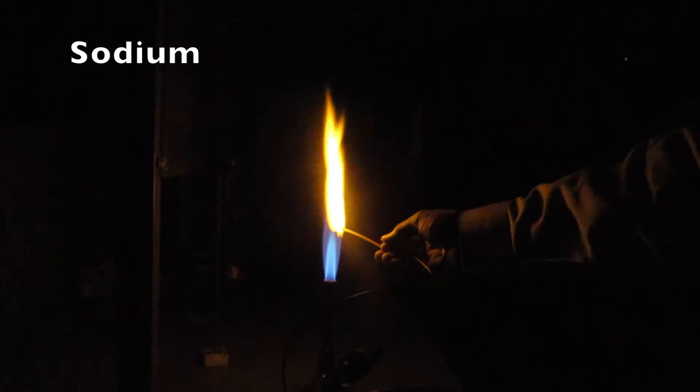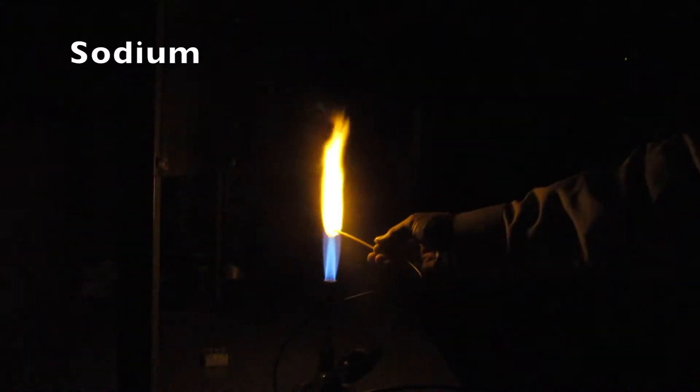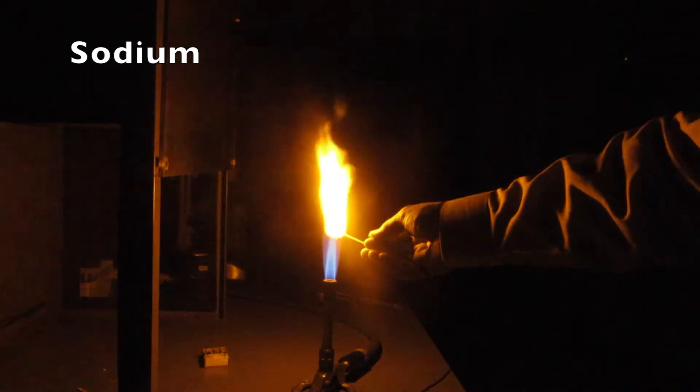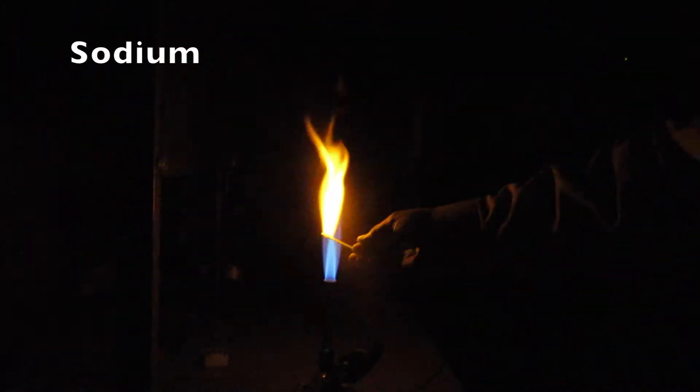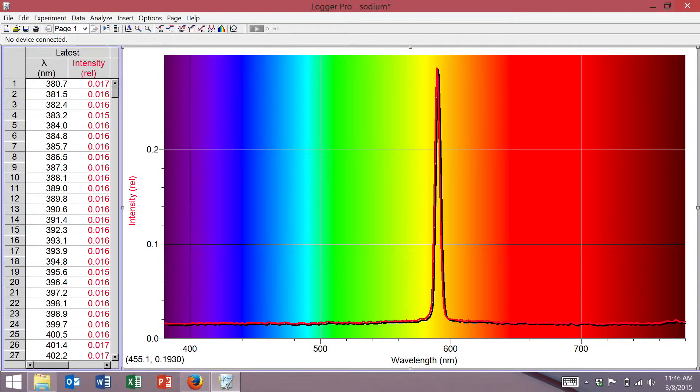Next up, we have sodium. Sodium is known for its intense yellow, yellowish-orange colors. Here we see the photons produced are roughly around 595 nanometers.